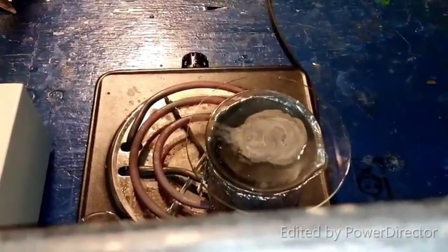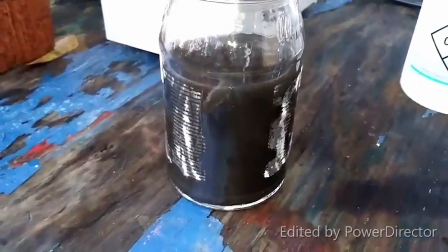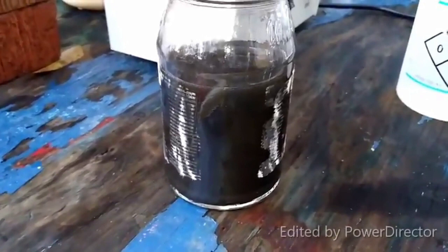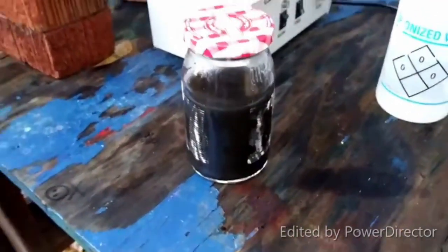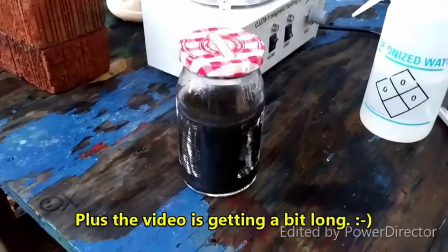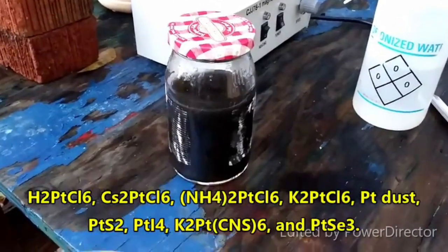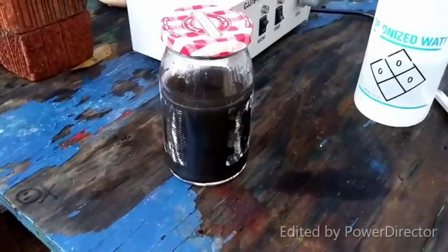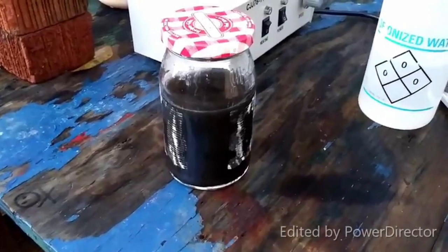So anyway, cool, huh? All right, everyone. I am having some issues here with reducing all of these platinum compounds back down to platinum sponge. Probably contamination from some iodine, from the platinum tetraiodide. So I'm going to have to do some more work on this platinum black slash platinum sponge, whatever it technically is, before I can do anything else with this. So unfortunately, I've got to call it here. But we did technically make 8 platinum compounds. So the goal is reached. Wasn't quite as good as I had hoped, but given that I was just going by atomistry articles, which are not exactly extensive, I'm pretty pleased with how this turned out.